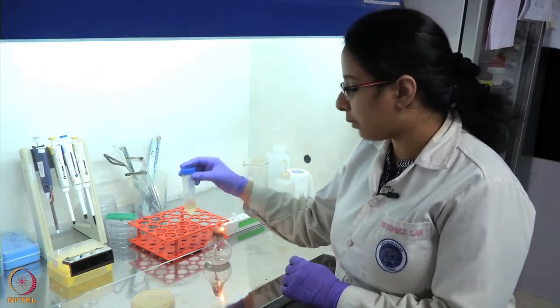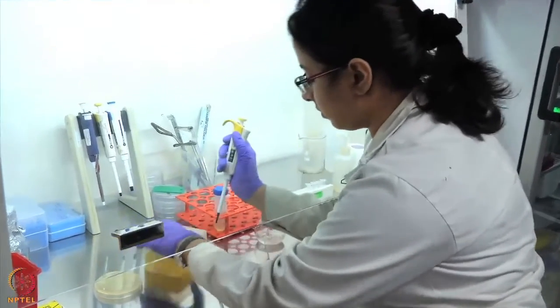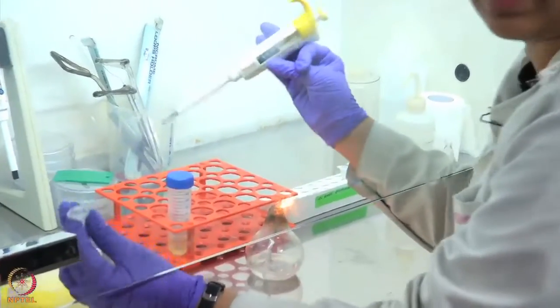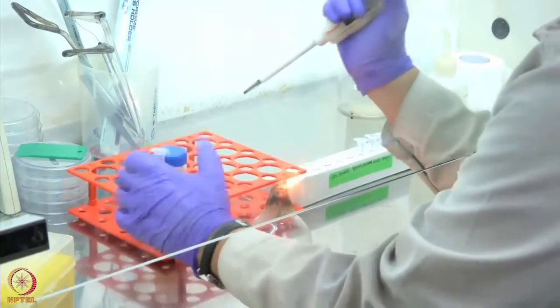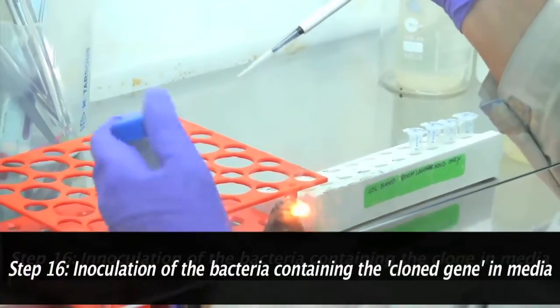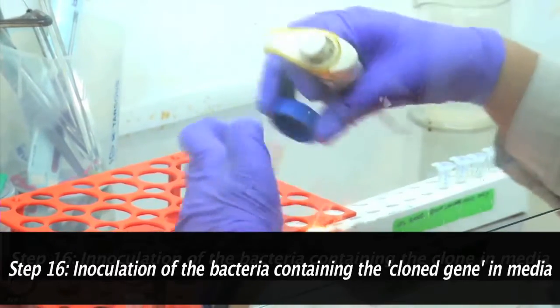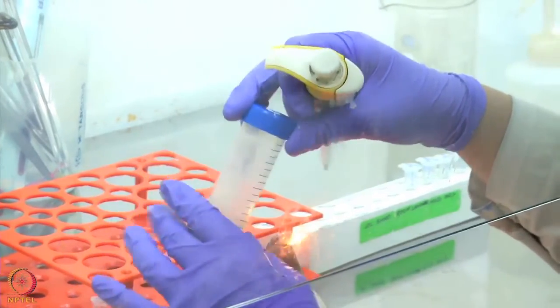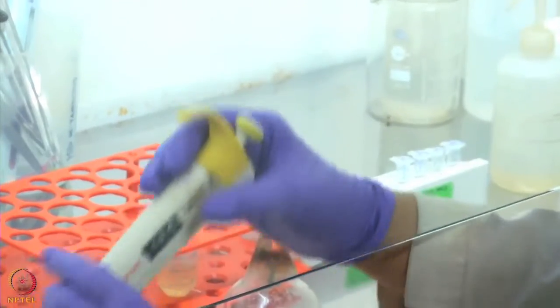So we will first add the antibiotic. This is our antibiotic ampicillin. Everything we are doing near the flame so that there is no chance of any contamination. Now I will pick up a colony.